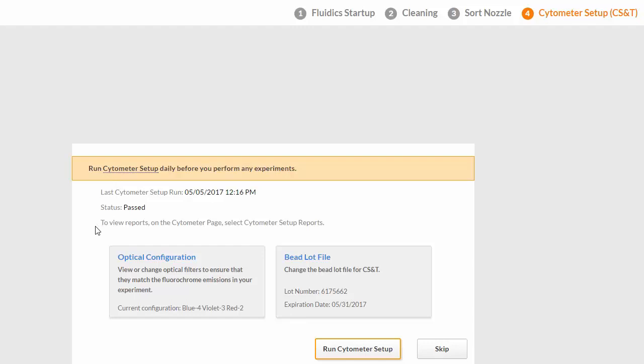The last run and status are displayed. The next step is to view or change the optical configuration.